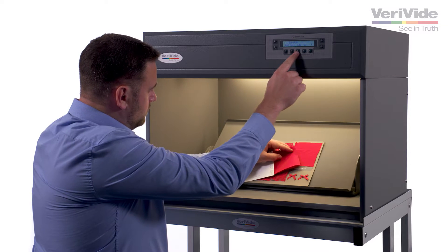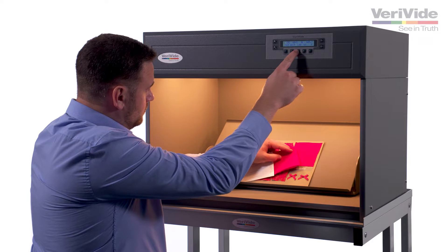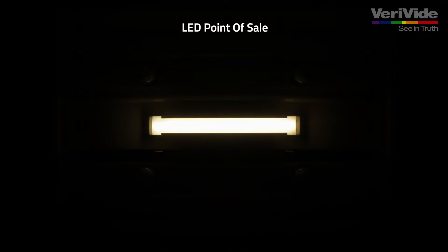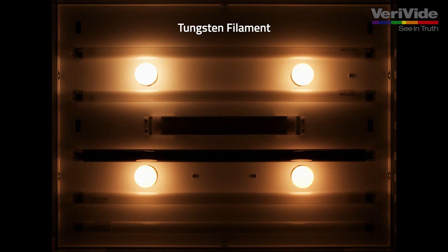Replacing lamps is a necessary part of maintaining performance of your Verivide light cabinet. Lamps must be changed annually or after 2,000 hours of use. Lamps are available to purchase from Verivide or our official distributors. Only Verivide and our official distributors can provide the correct replacement lamps that ensure standardised viewing conditions.